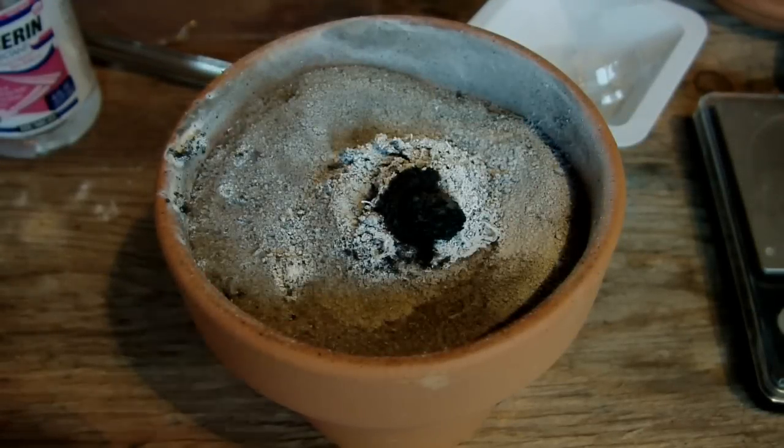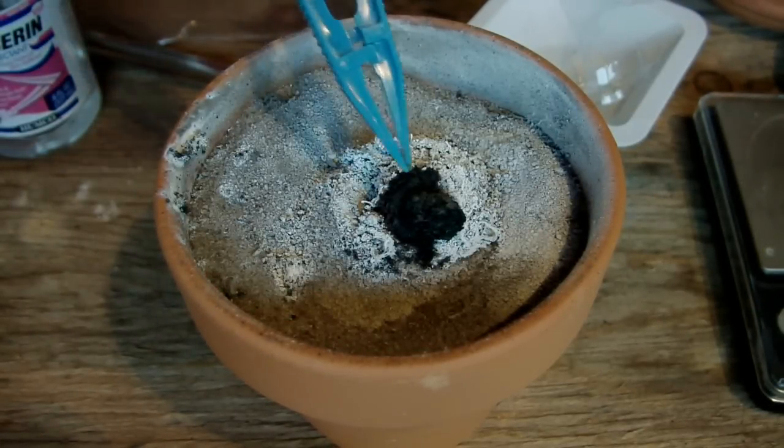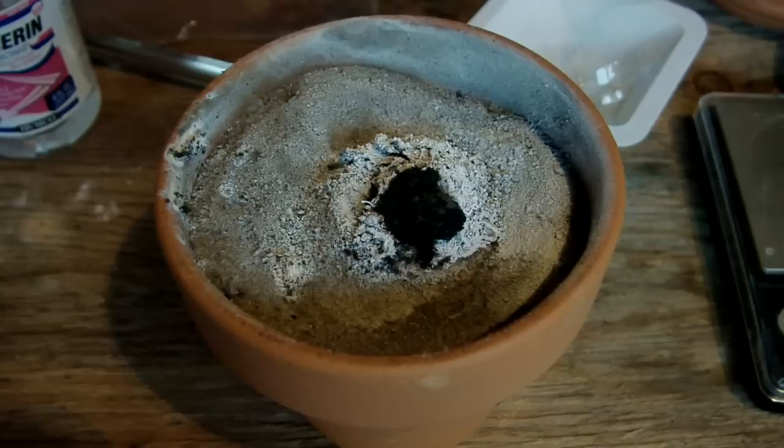Here are the products of the reaction after cooling down and being uncovered. The black is from the glycerin reaction used to start it, and all the white around it is magnesium oxide. Hopefully we've got some elemental boron somewhere in that mass. Now we're going to move on to the last step — dissolving the reaction products in hydrochloric acid — so I'm going to powder this up first.